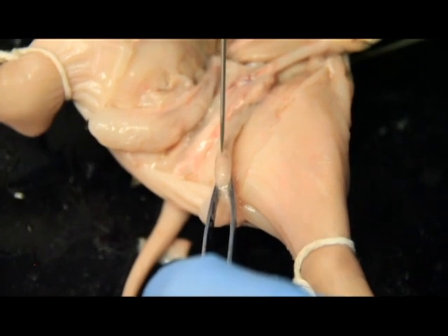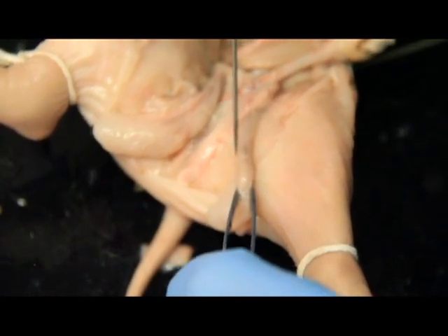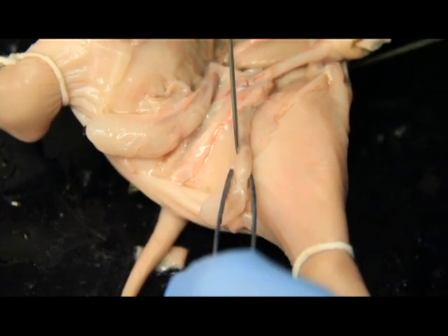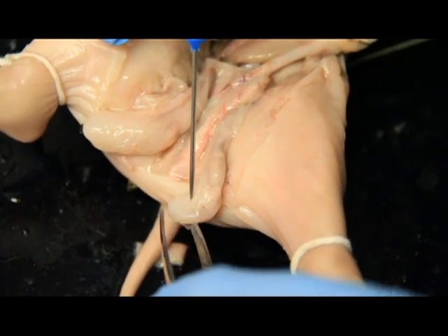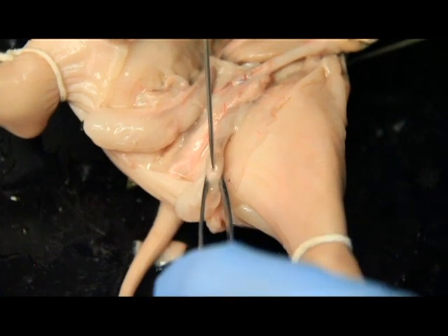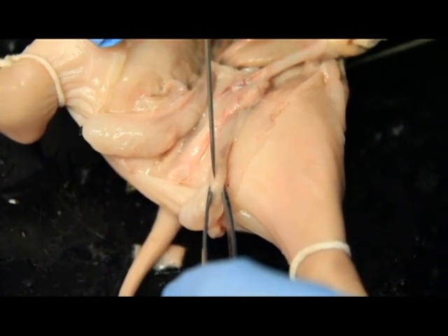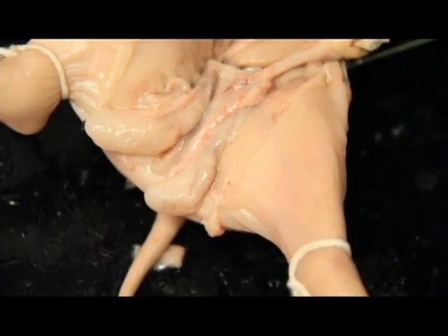And then you can see this tiny flap sitting on top of it. And that actually goes all the way around on the side. That is your epididymis. So this is the scrotal sac, this itself is the testis, and this little flap right here which comes all the way down and around, covering the testis, that is the epididymis.